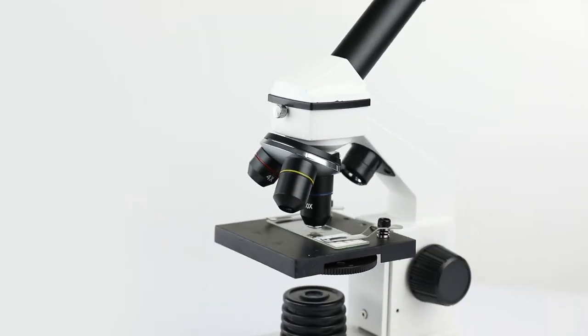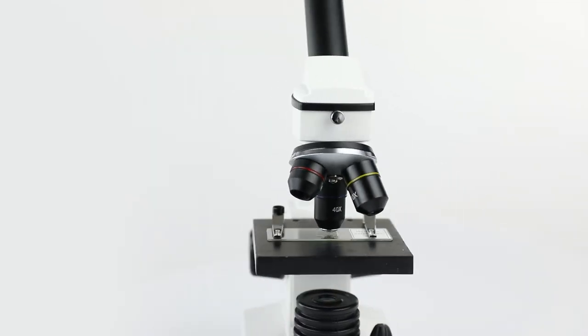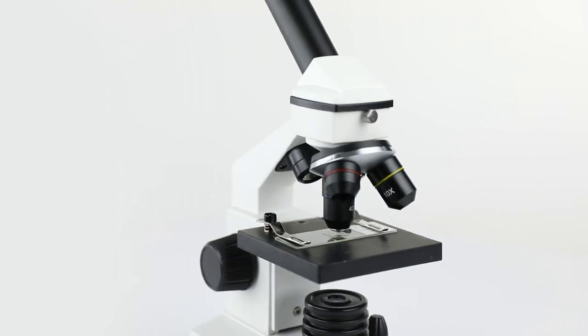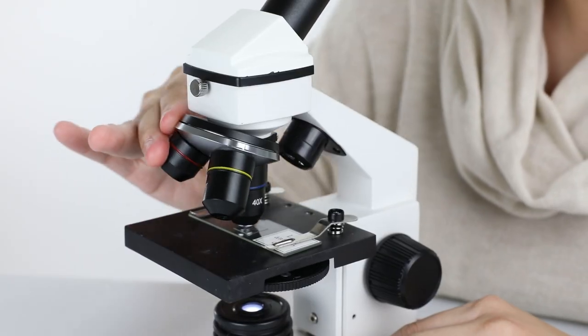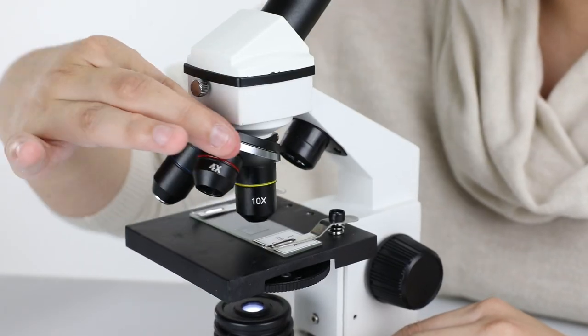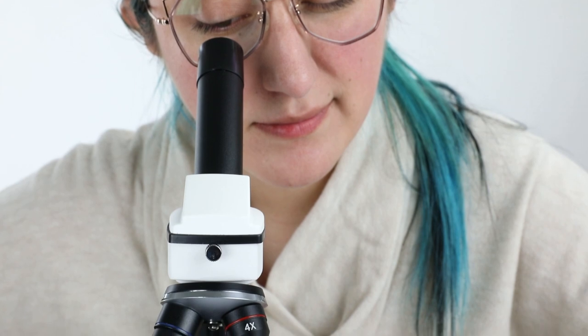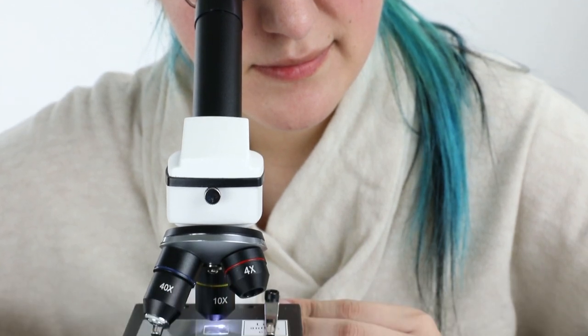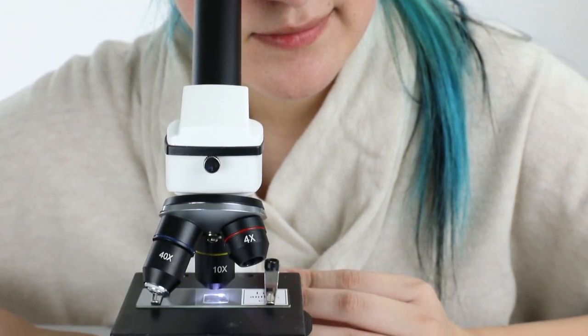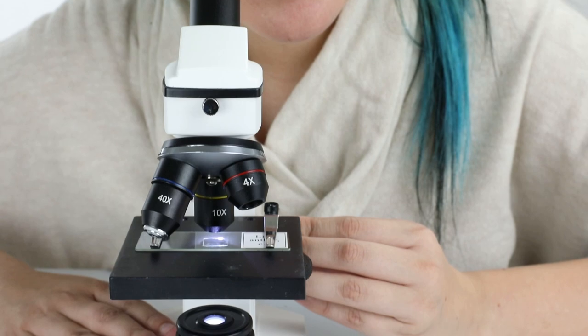Inside, you'll find Celestron's signature optics for sharp views with excellent detail. Three glass objectives combined with the included 10-power eyepiece provide 40x, 100x, or 400x magnification.